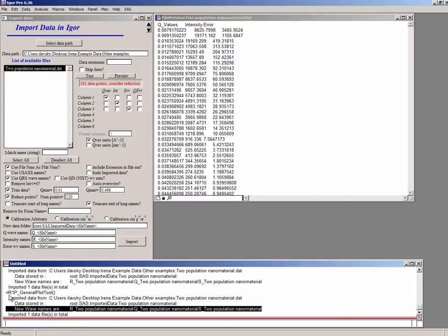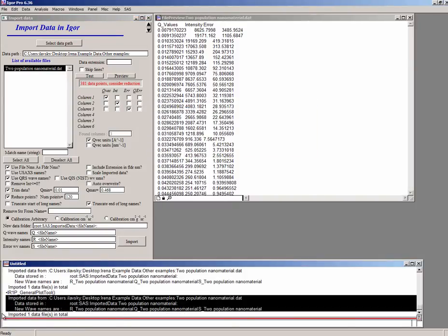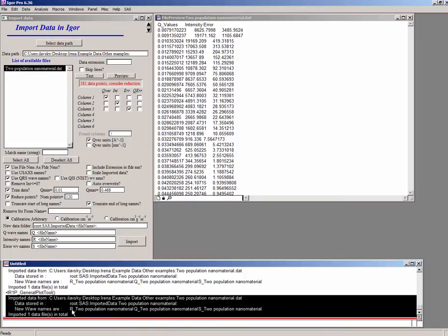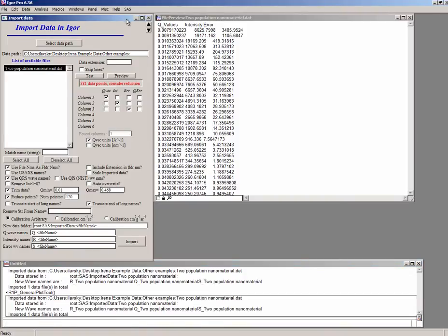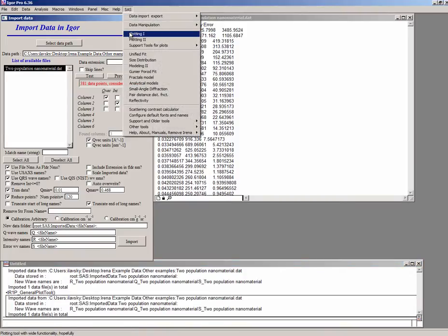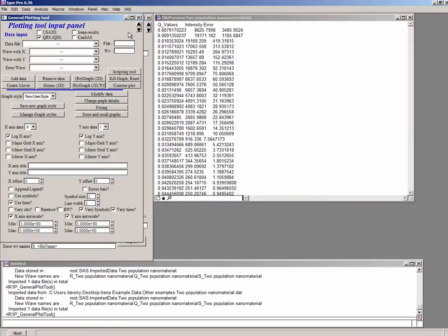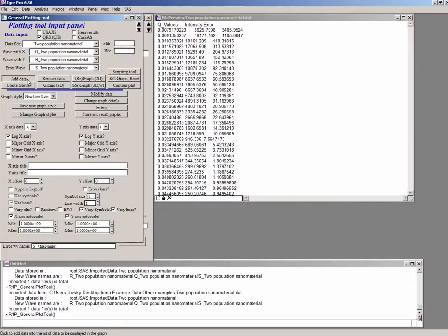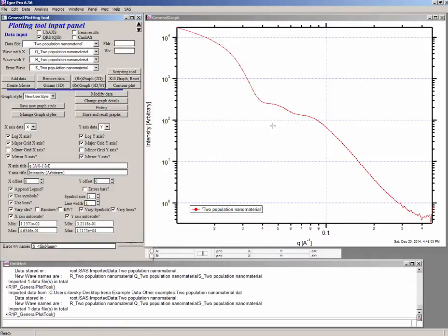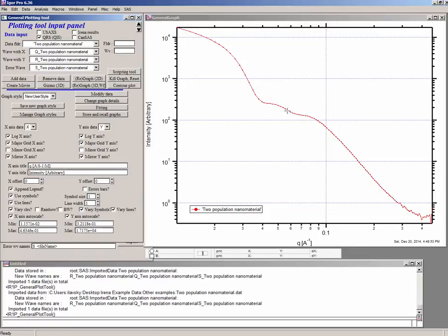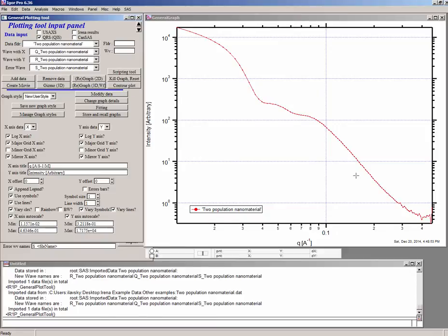Down here it will say what it did. So there's some kind of history area description here. Let's go back to the plotting tool and let's pick on the data again and add them in. Notice that what now we have is we have obviously a reasonable behavior at low Q. We have a very nice behavior out here. And as it goes out and out more, we get much less noise out here. So now we have a much better conditioned problem, numerically conditioned problem. We have also removed some of the noise at the high angles, which otherwise the least square fitting would get confused about. So now we have a data set which is basically ready to do some fitting.